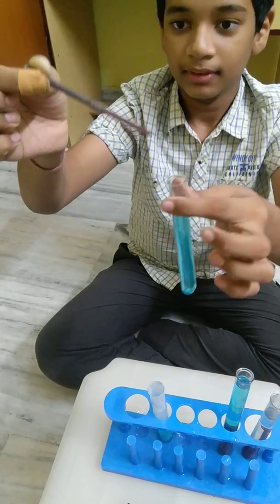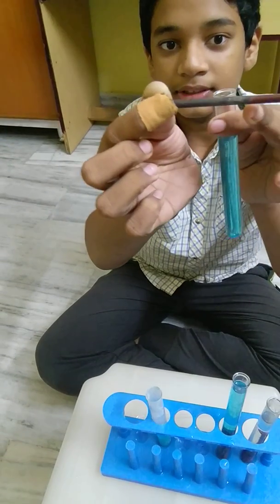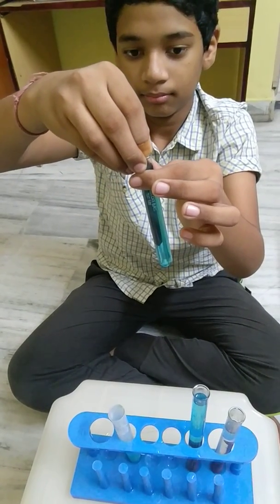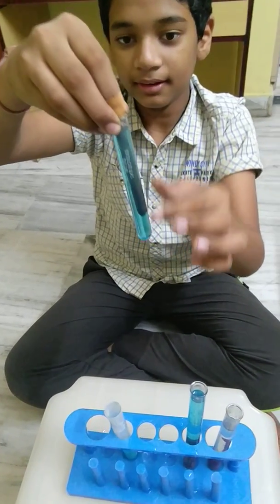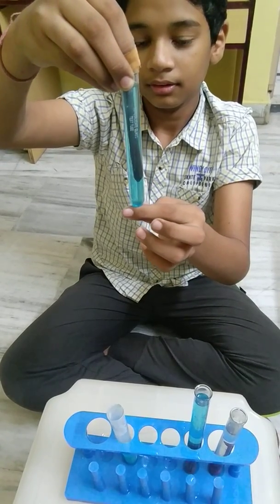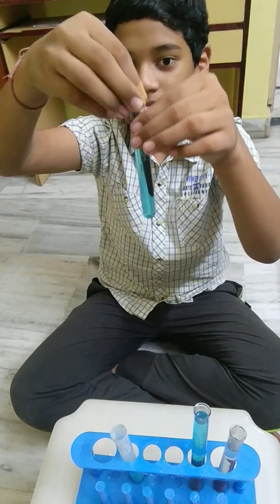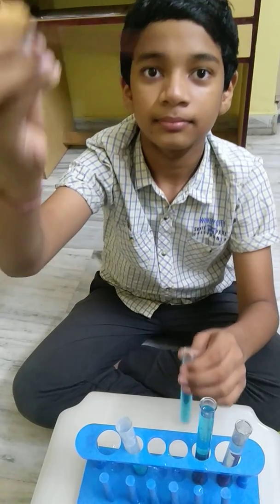So, let's try it again. This time I am going to dip it further into the solution, and as you can see this area is completely normal. 10, 15, and 20. And when I get it out, more layer of copper has formed on the iron nail.